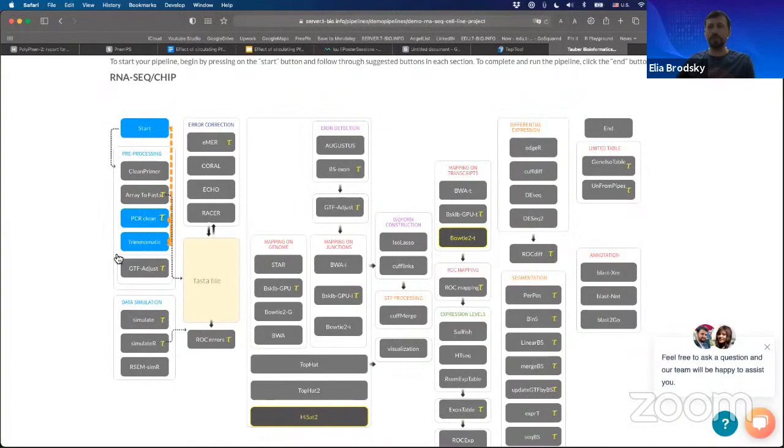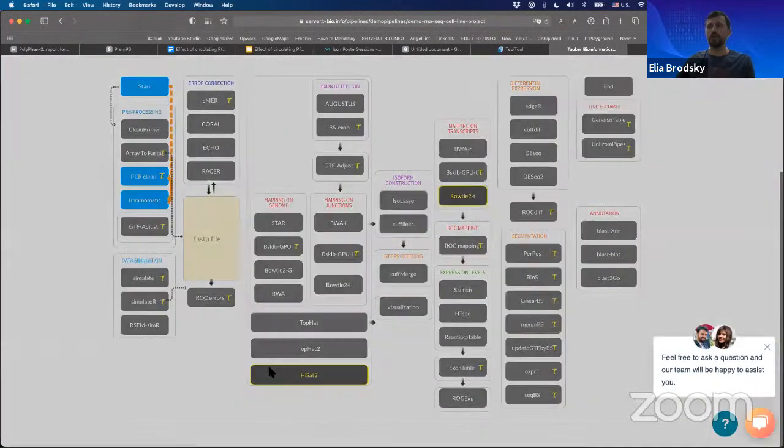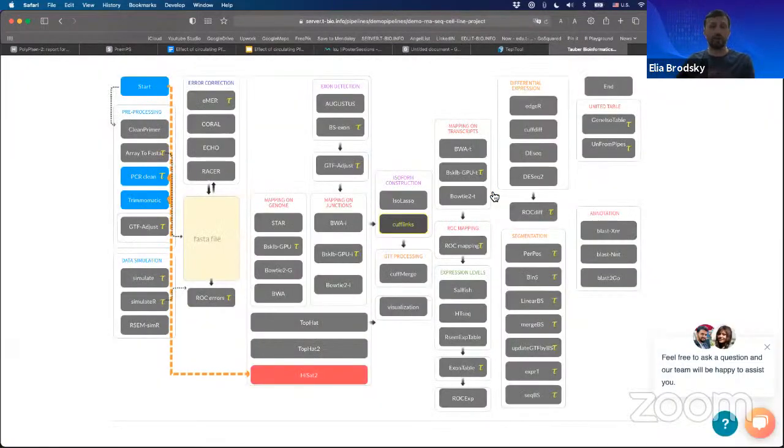After we have completed this trimming, we can then proceed to select one of the mapping algorithms, and there's quite a variety of different mapping algorithms that might have a particular benefit for a study that you might find on public domain repositories of next generation sequencing data like NCBI.